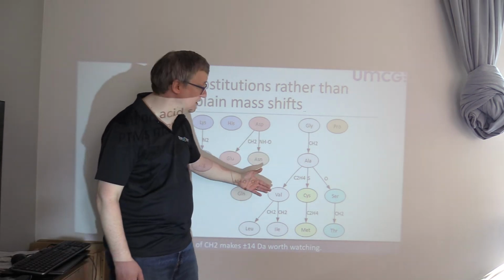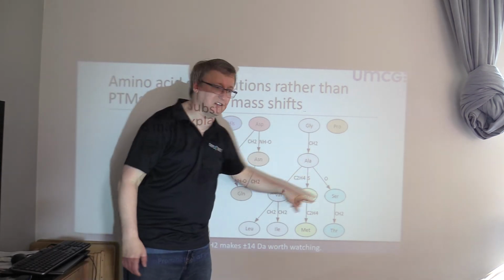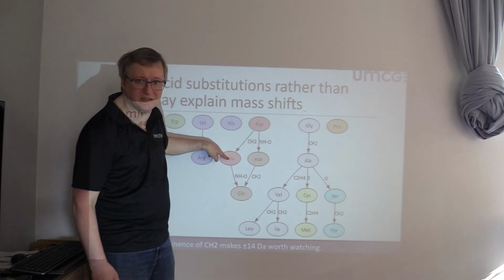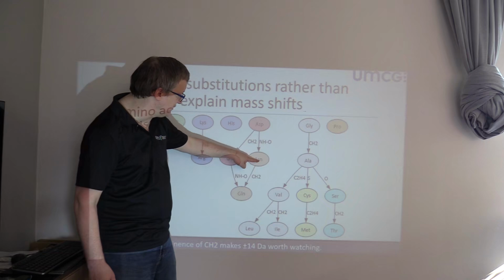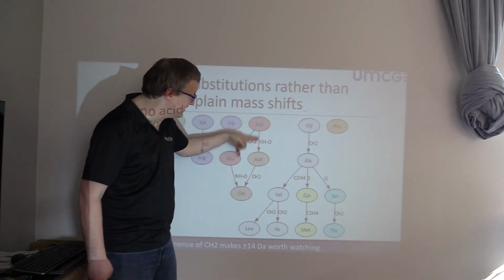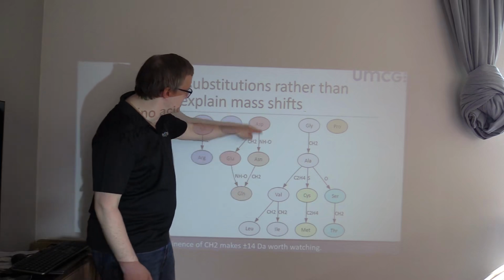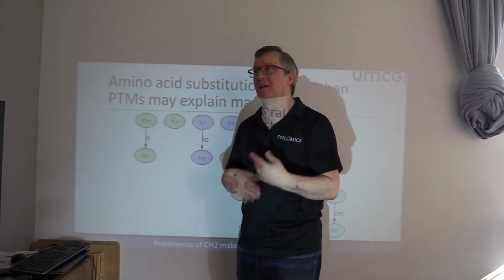It certainly can happen. It might be that just an oxygen is all that separates the masses of two amino acids. There's also this kind of happy family here that we see aspartate and glutamate differ by only a methyl, and asparagine and glutamine differ by only a methyl, and in turn, aspartate and their corresponding asparagine and glutamine differ by adding an NH and subtracting an oxygen. So this family of four is very tightly related.